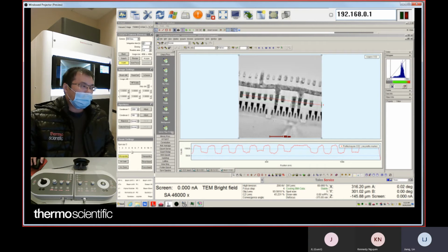By combining more frames, you increase the count. But if you use the objective lens aperture, you're not going to increase the intensity count, but you're going to increase the contrast. That means your darker regions look darker, your bright regions look brighter.